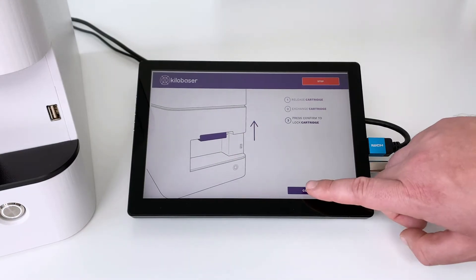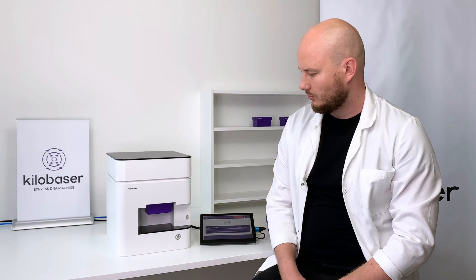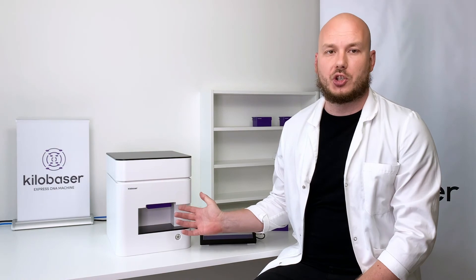And again. And that's pretty much it. One Raging Carriage has material for 200 bases. You either have to change it after using those 200 bases, or when the cartridge has stayed for two weeks on the machine.